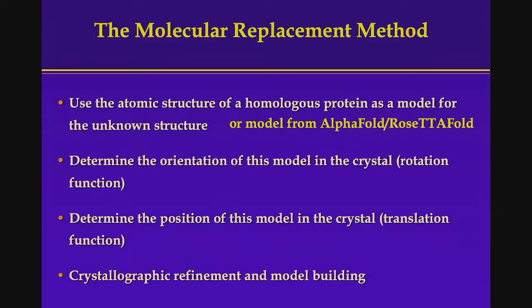So that's the first thing we try. It takes only a few hours, a few days, rather than having to spend time making selenomethionine protein, all that stuff. A lot of extra experiments you have to do. This is all done on the computer, very cheap, doesn't cost anything.